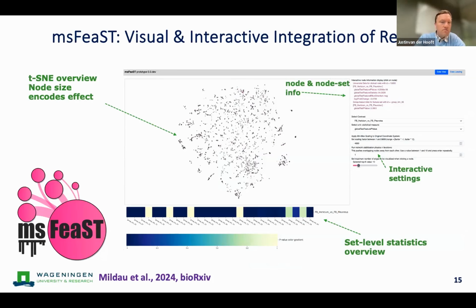The tool comes with an interactive dashboard, so that you can quickly study where in this dashboard the things are happening that are relevant for you. You can also use different questions or statistical tests and check one by one which areas in your chemical space or map are relevant.